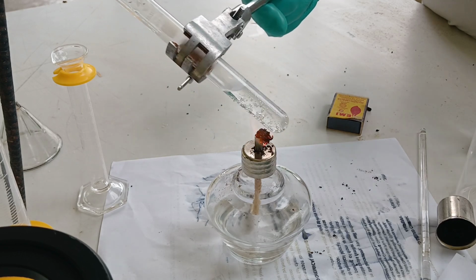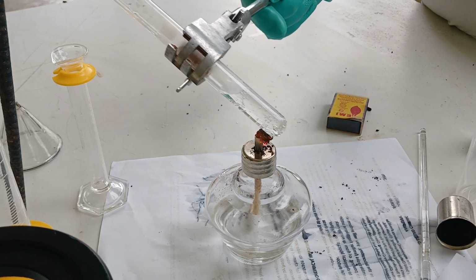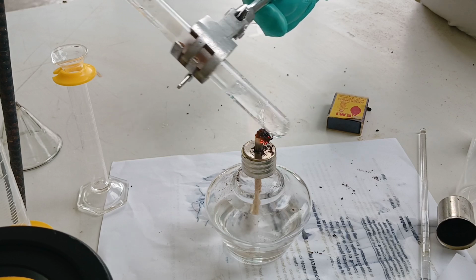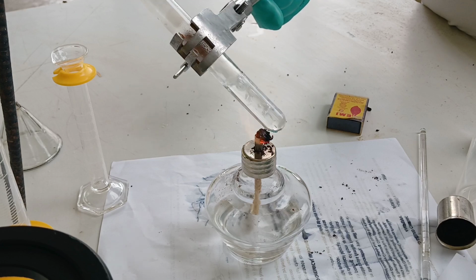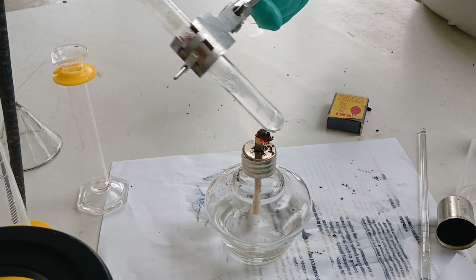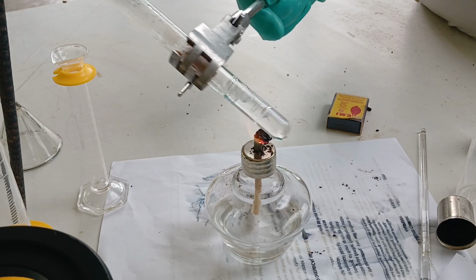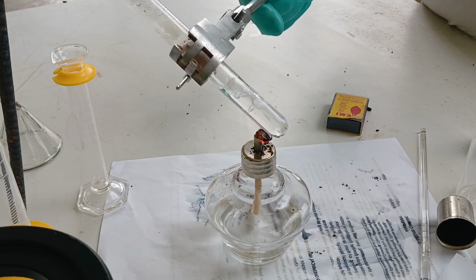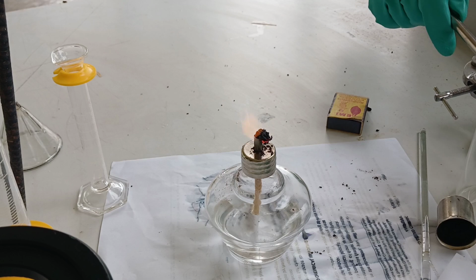It nearly boils. Once it boils, or when it has completely reacted, then you have to stop heating. Hold it at an angle of 45 degrees, and never point it to anybody else, including yourself. Heat the bottom only, on the filled portion of the test tube. Use the test tube holder to prevent burning your skin or your hands. That's it. The reaction has been completed.